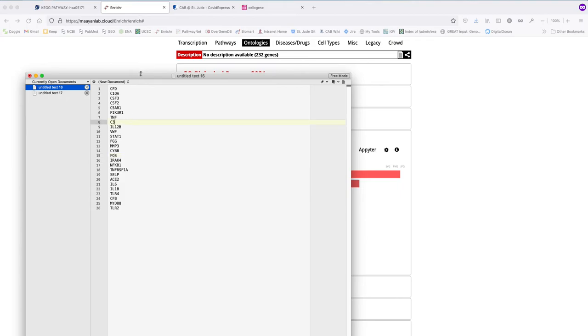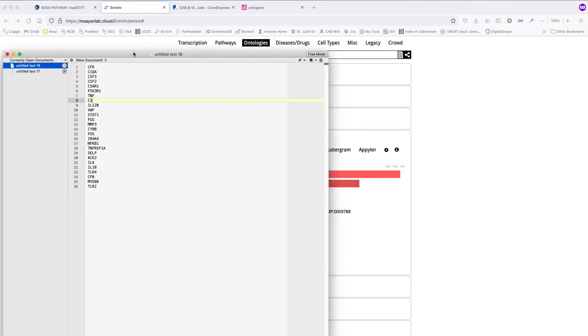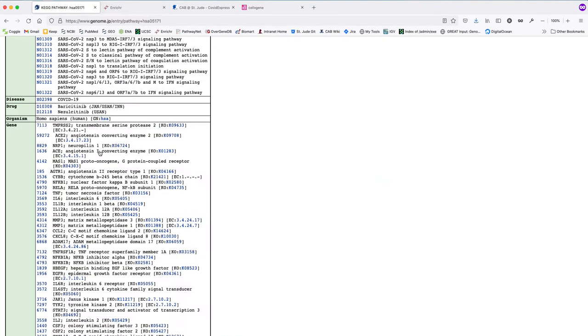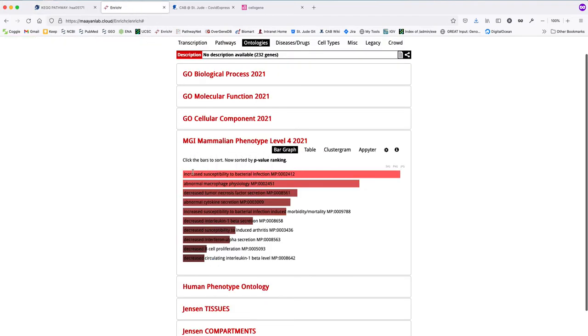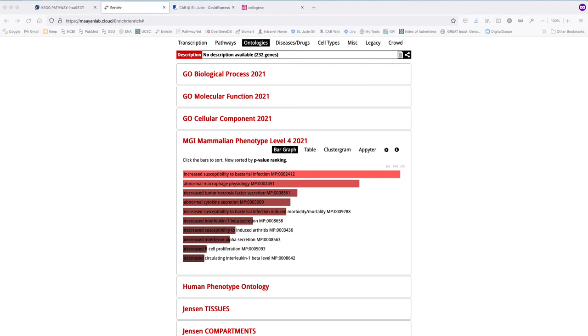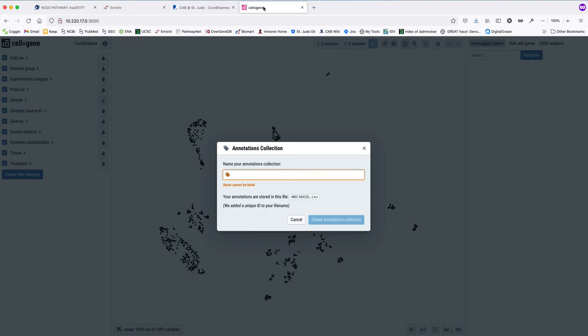Very important. So with this list of genes, we then wanted to ask, are they upregulated? We know that they are important for COVID-19 disease, and we know that they are enriched with or associated with increased susceptibility to bacterial infection. So the question that we wanted to ask: what happens with them when different phenotypes, COVID versus control, for example, are explored?